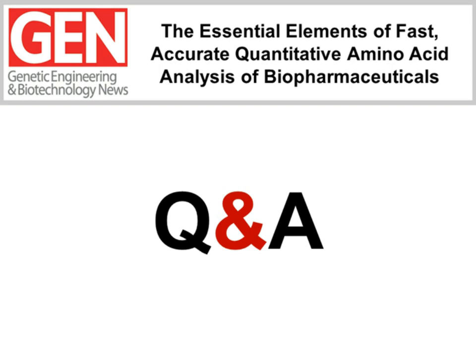Thank you, sir. And Tom, is your method USP? If not, do we have to fully validate? In terms of the USP description of amino acid analysis, we need to think about two parts of the USP monographs. The general chapter on amino acid analysis lists, I think, 9 alternative methods that are acceptable for doing amino acid analysis, and this is one of those methods. So it can be used within the guidelines of the USP.